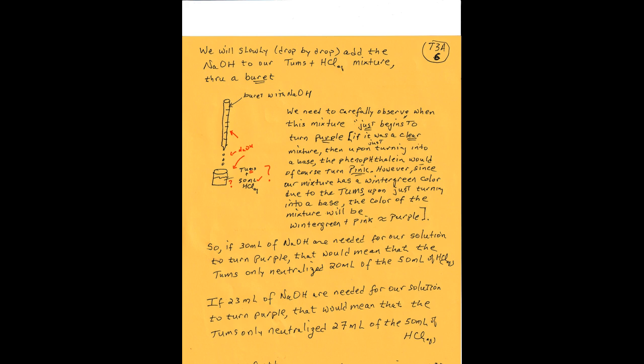So we need to carefully observe when this mixture just begins to turn purple. If it was a clear mixture, then upon just turning into a base, the phenolphthalein would, of course, turn pink. However, since our mixture has wintergreen color due to the Tums, upon just turning into a base, the color of the mixture will be wintergreen plus pink, which looks a little purplish.